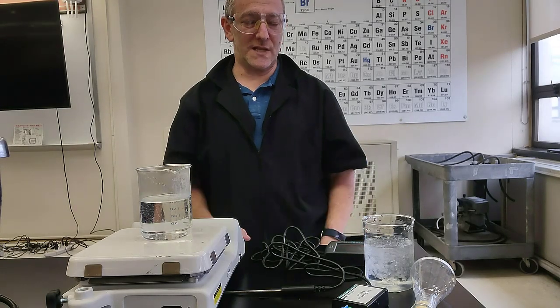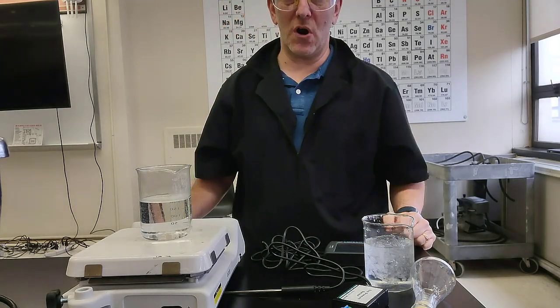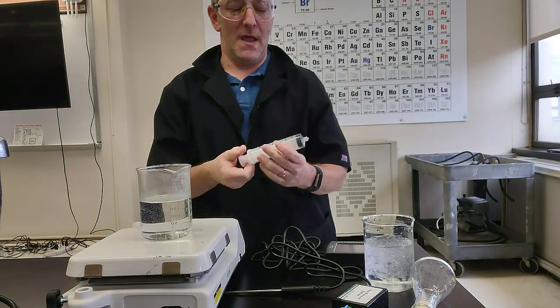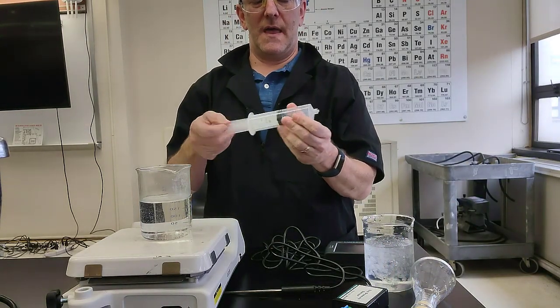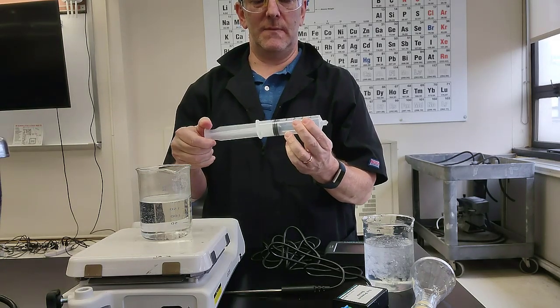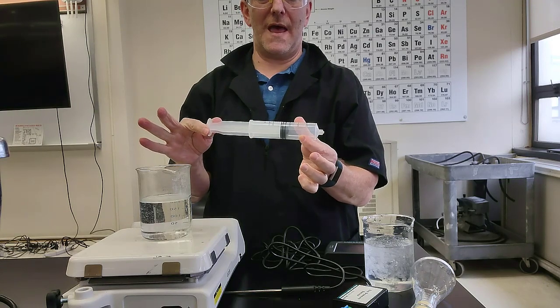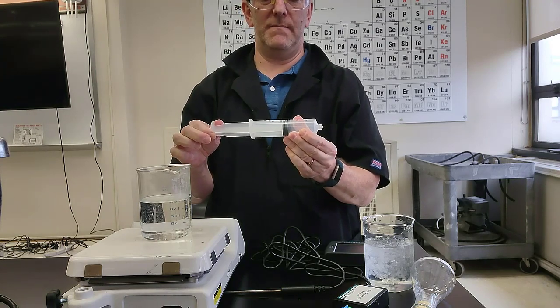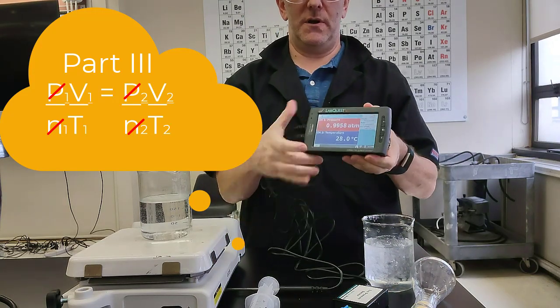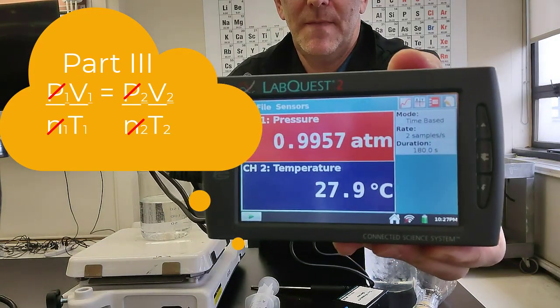All right, so for the next part of the experiment, we're going to explore Charles's law, the relationship between volume and temperature. So I have a syringe here that the plunger moves relatively easily back and forth. It's a 60 milliliter syringe, and I'm going to set it to half of its volume at 30 milliliters. I have my Vernier hooked up here, and it's measuring both pressure and temperature.